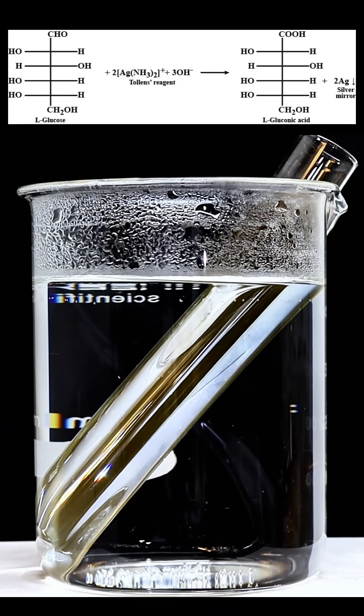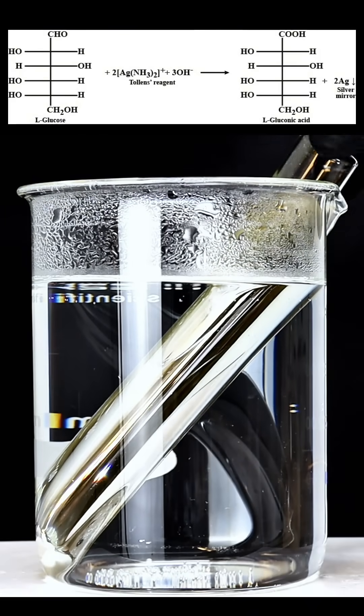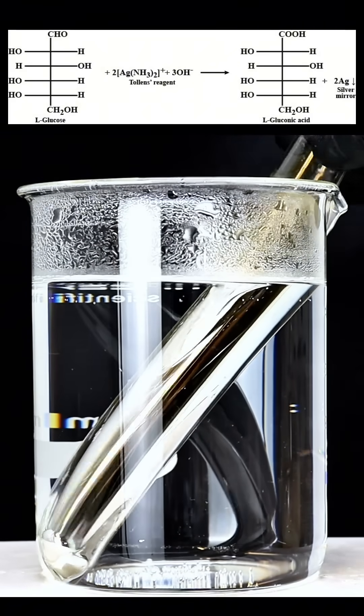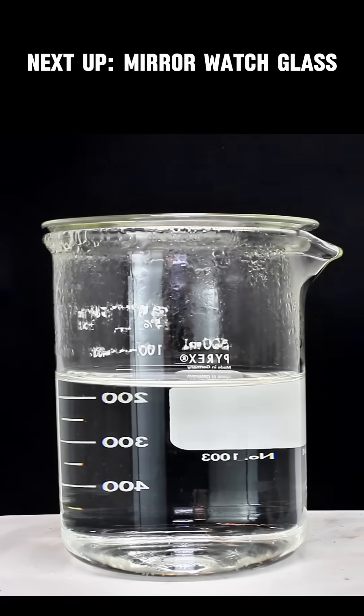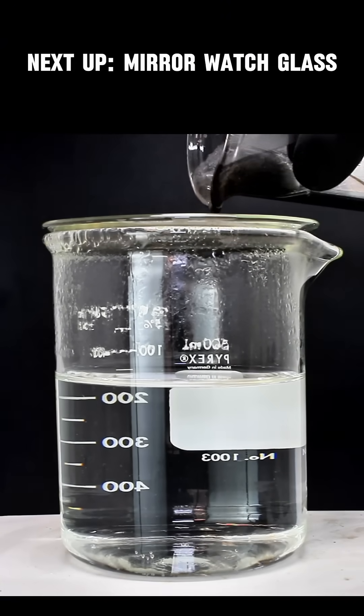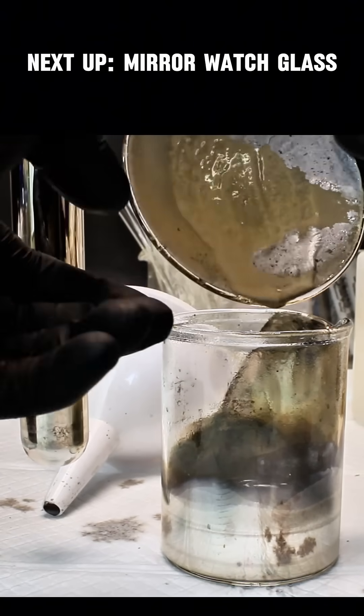The resulting solution can then either be poured into something that you'd like to plate the inside of, or sprayed onto the outside of something you'd like to plate the outside of. It will probably destroy your spray bottle though, so I decided to stick with pouring. Also, as far as I know, the spray application requires formaldehyde and glucose won't work.